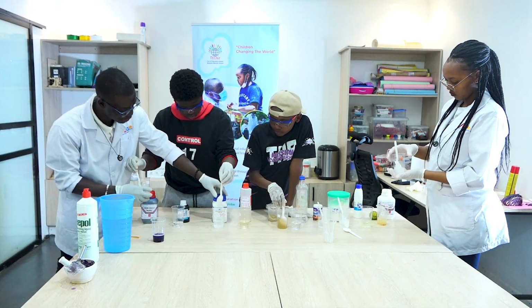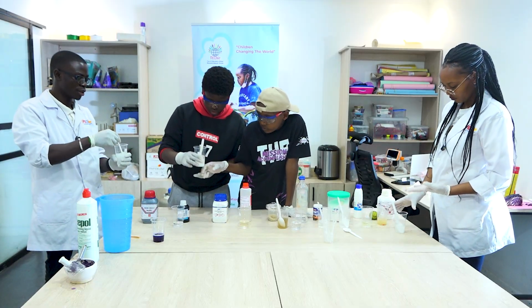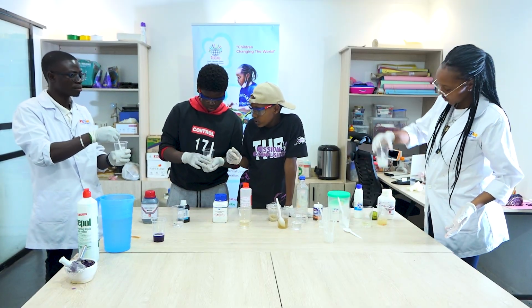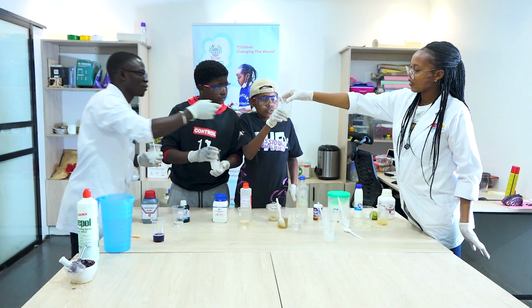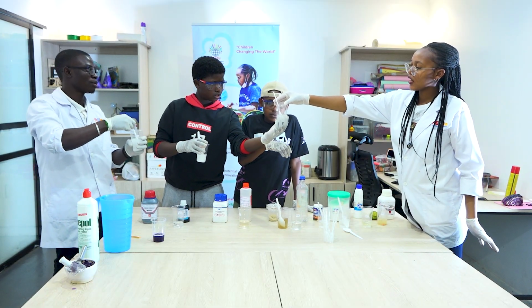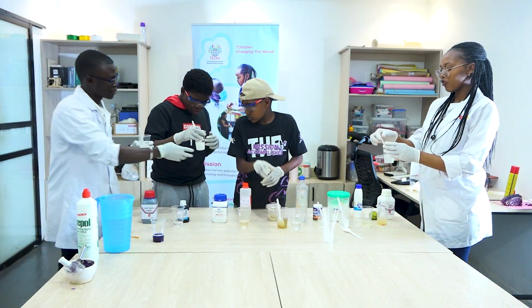For example, we have this one here. I'm going to ask you to just stir it and feel. This is potassium hydroxide. Just place your finger over there, you can touch it this way. You feel it is starting to get hot. Yeah, it's starting to get warm. In a chemical reaction, you either produce heat or a gas is evolved.